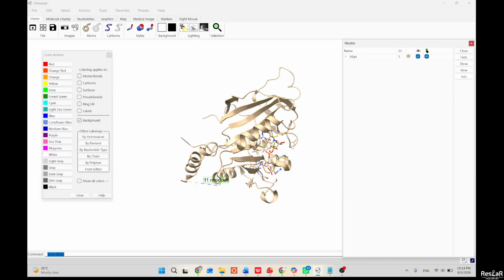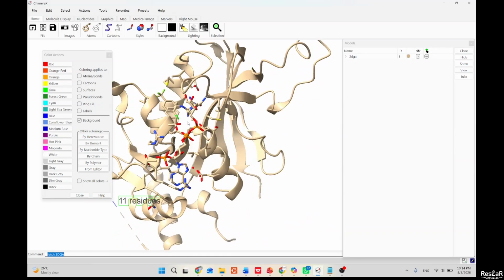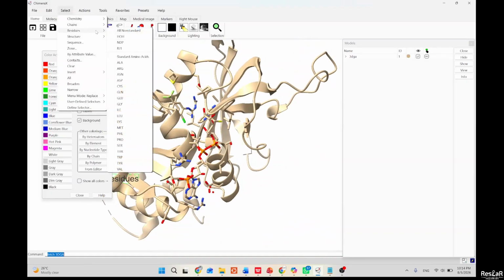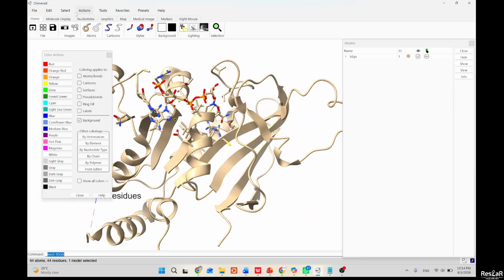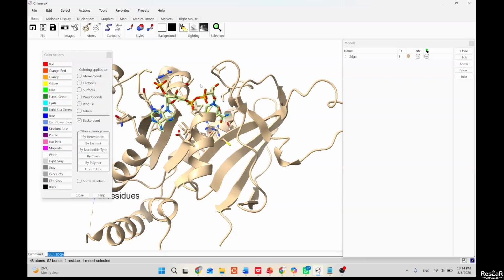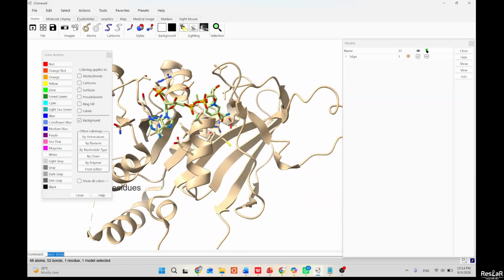Fine. So this is our protein that has a ligand. What do we do with it? We also have so many other cofactors. If you check select and look at residues, you're going to see water. You see a few water molecules are selected, so we'll also want to delete those. If you check again, you are going to see NDP, which is some co-crystal ligand, cofactors.